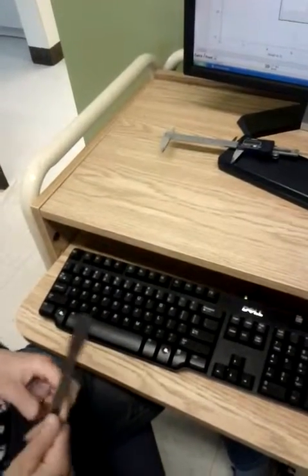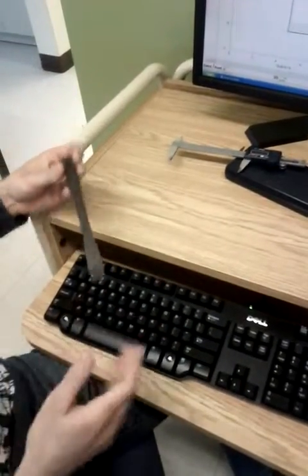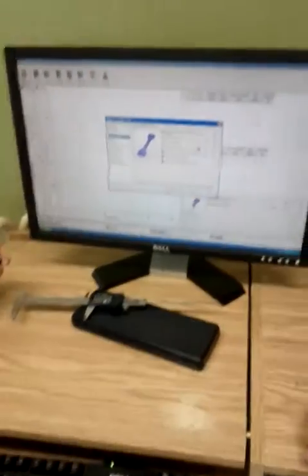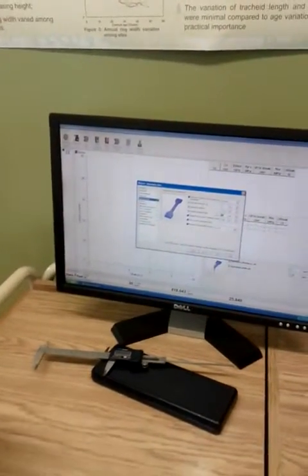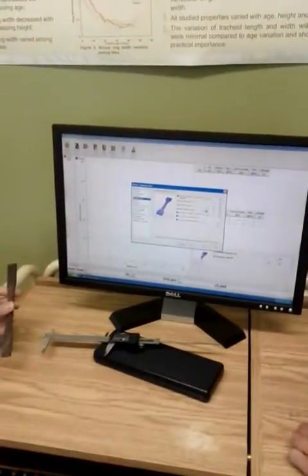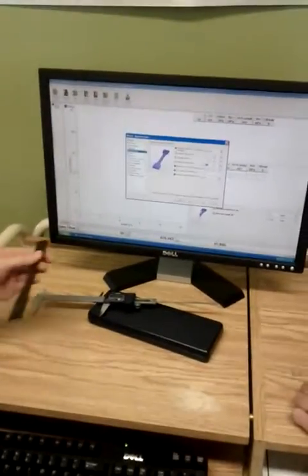The extensometer is a piece of equipment that measures the strain only here. But we don't have it, so you put the grip to grip separation. To have a more precise test, you need the piece that measures the distance here. If you have to do some kind of more precise test, you need this. But to compare two materials, you just do like we used to do. So this is done.